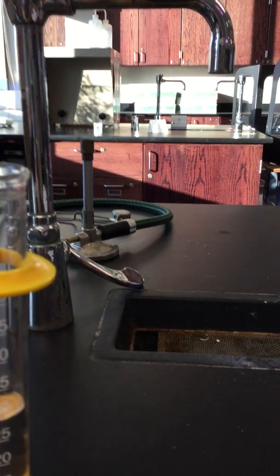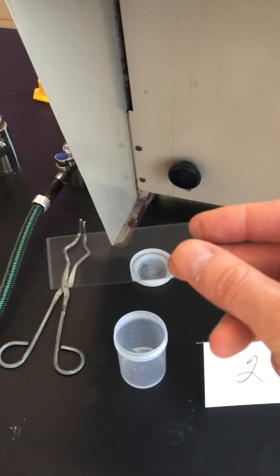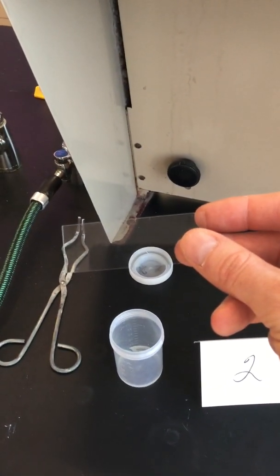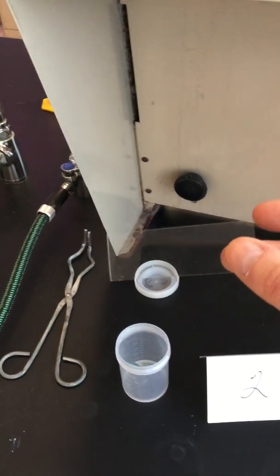All right, moving on to station 2. Station 2 talks about glass, and we're told that glass is silicon dioxide, and we're trying to figure out how many atoms are in a piece of glass. So you might want to think your way through what sort of data you might need to answer that question. Here's our glass. If you want to pause the video and think to yourself, how am I going to figure out how many atoms are in this? What data do I need? Go ahead and pause the video.